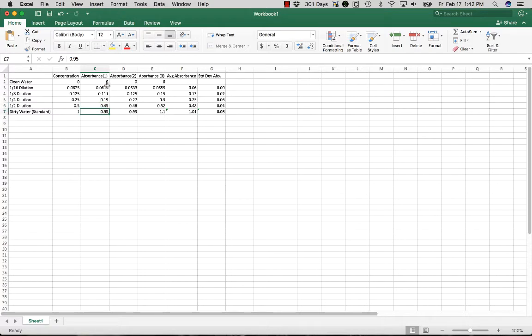So in order to do this, right, you would have your photometer built, you would put the sample in between the light source and the photocell, you would get a reading from the photocell, you could convert that into an absorbance value using some of the mathematics and the equations that we showed you in class and in some of the examples, and you get absorbance values here.